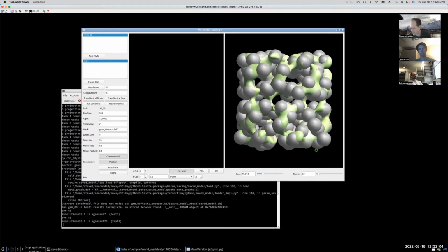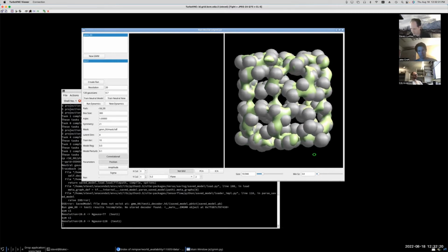I'm not sure whether we will as easily detect the presence or absence down here, even though that seems like the easier thing to find. I could make it a little bit lower, but I think 128 is probably a reasonable starting point because I don't want to spend a really long time on this. The computer I'm running this on is my workstation at work, so it's got a single NVIDIA 2080 card in it, which is pretty fast, but it's not as high end as some people might have on their workstations.